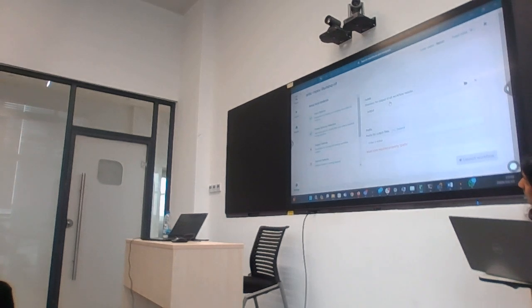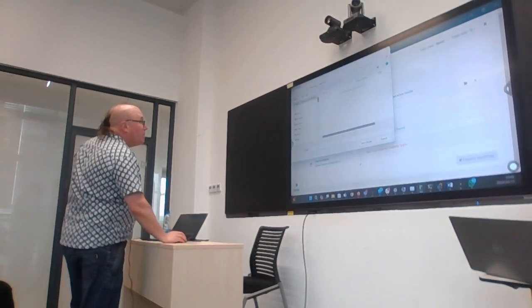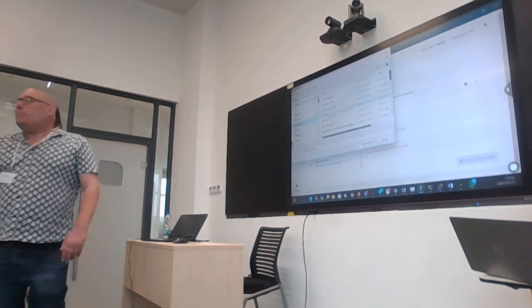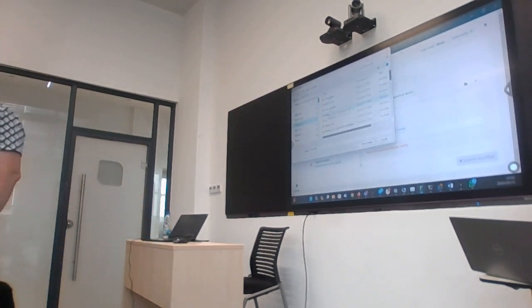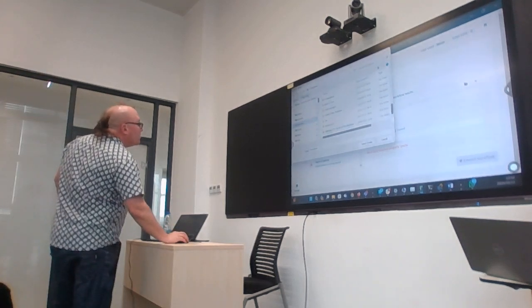Okay, so I click here, and now I need to make an empty folder. Okay, so I'm busy choosing the output location, but it doesn't exist yet. I need to make it still. Okay, so I make the new folder.